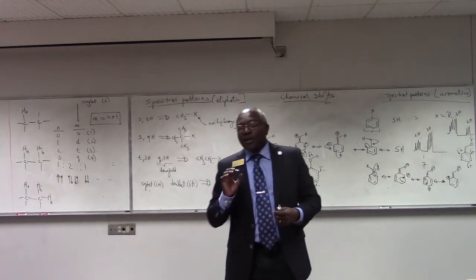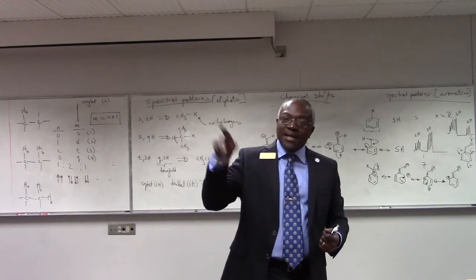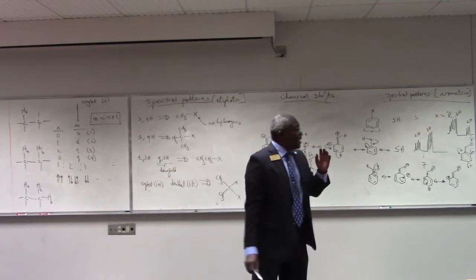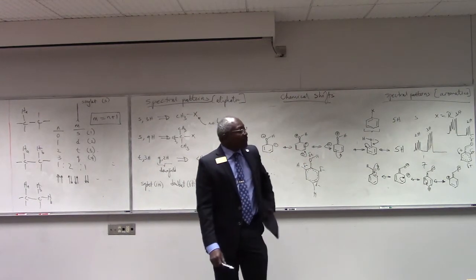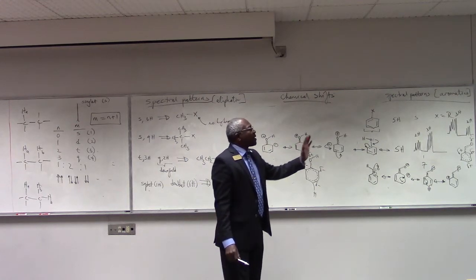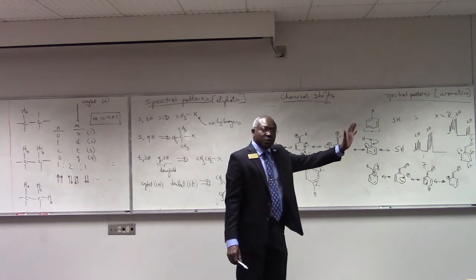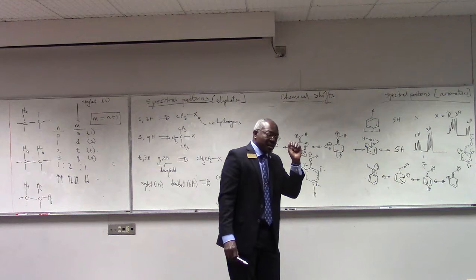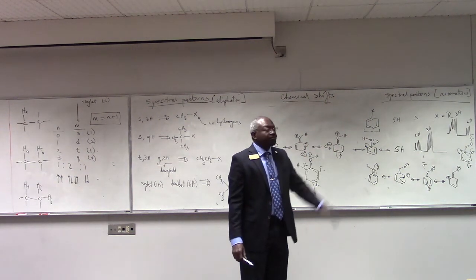If it's an alkyl group at 60 megahertz, you just see a singlet for 5 H's. But if it's a strongly electron withdrawing group, carbonyl, cyano, and so on, I will get a downfield integral for 3 and an upfield for 2. If it's a strong electron releasing group, I'll get a downfield set of 2 and an upfield set of 3.